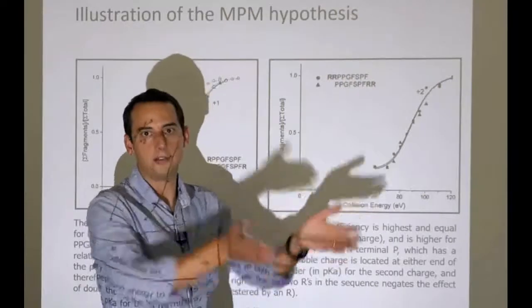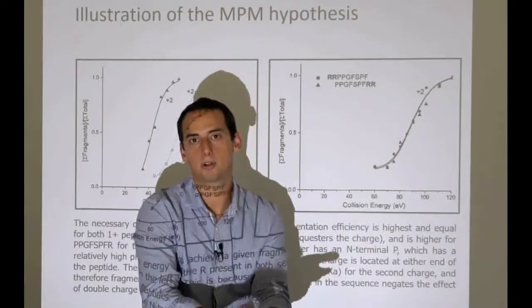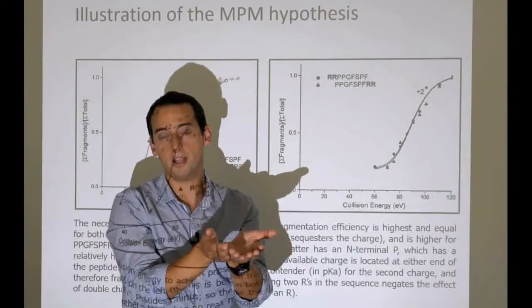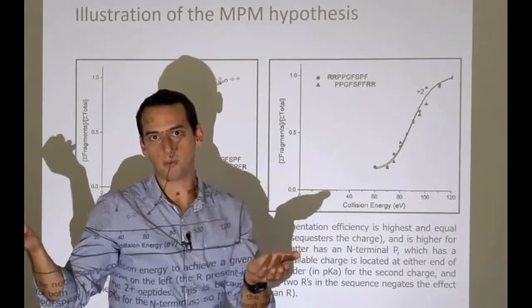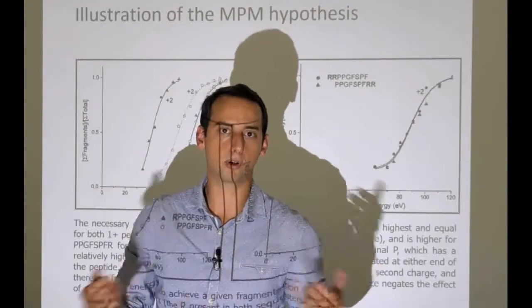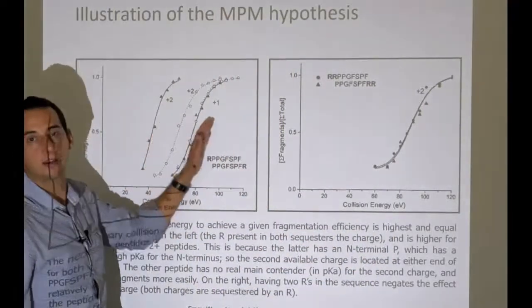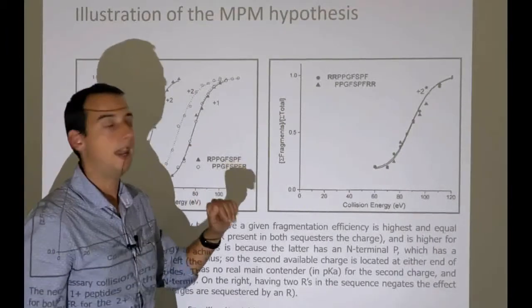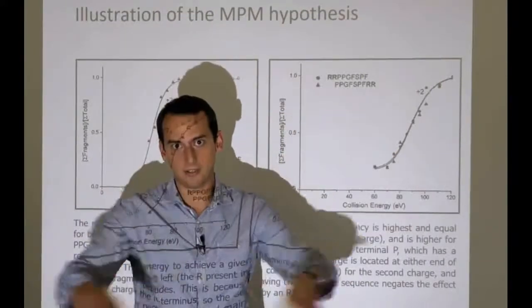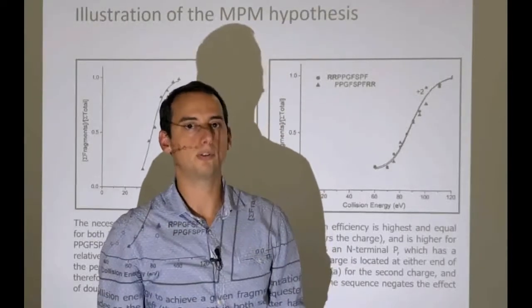The energy well, the energy valley in which the proton sits in arginine is much deeper and much more comfortable than the one in lysine. It's 100 times deeper, 100 times more comfortable. So it's easier to dislodge that proton from a lysine, and therefore these peptides tend to fly apart a little bit easier and a little bit more comprehensively. So lysine peptides are shifted a little bit back compared to arginine peptides. And of course, anything with a proline at the N-terminus is harder to fragment because that creates a second valley for a proton to sit and not be mobile. So you will see these patterns if you care to look for them.